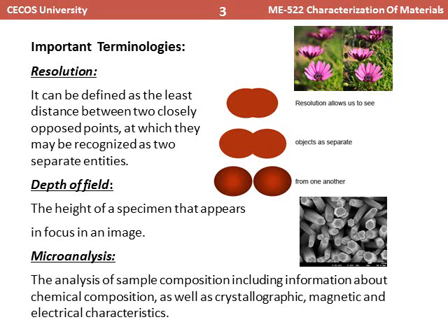As you can see, there is an SEM image of some nanorods. There are so many thin bars protruding in this image. You can see that these bars have a certain height. This certain height is normally observed by SEM, and we can term it as depth of field.